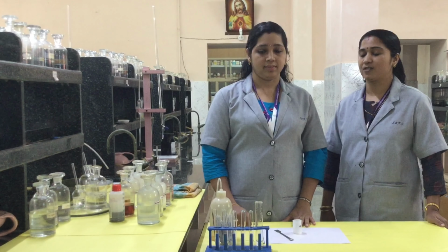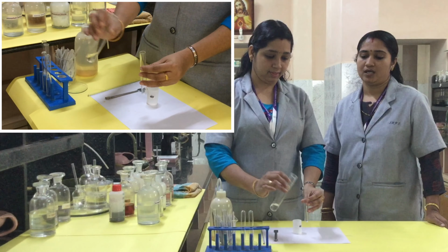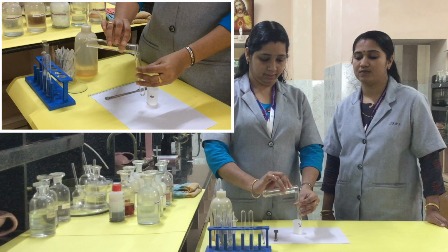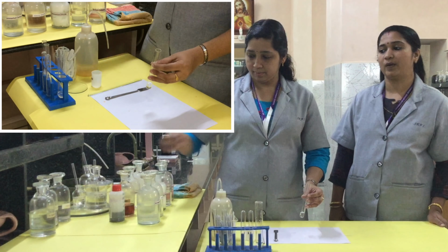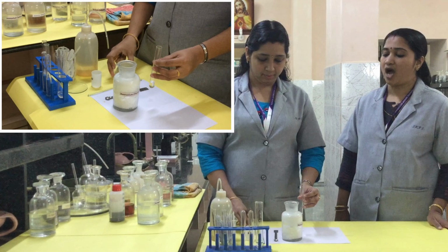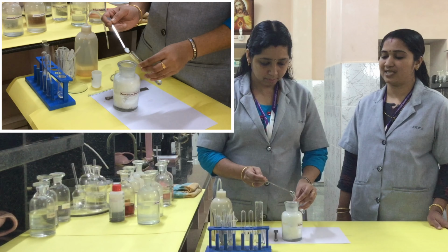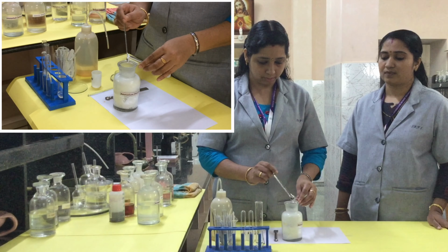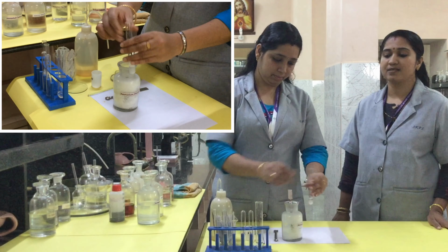We are not doing the test for group 2. Next is the test for group 3. Take a test tube and add some salt solution to it. Then add solid ammonium chloride. Using a spatula, add some ammonium chloride to the salt solution, and shake it well to make a saturated solution.